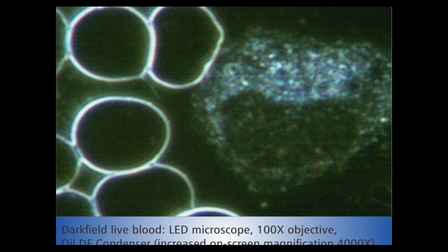Now, this is really important, because if it's not a microscope camera, then you'll often end up with spots on the screen that you just won't be able to get rid of. Now these are actually minute imperfections on the components in and in front of the camera sensor, and if they're there, there really is no way of actually getting rid of them. I've tested many cameras over the years, and some of them have had so many spots on the screen that you're really not even able to see the blood clearly.